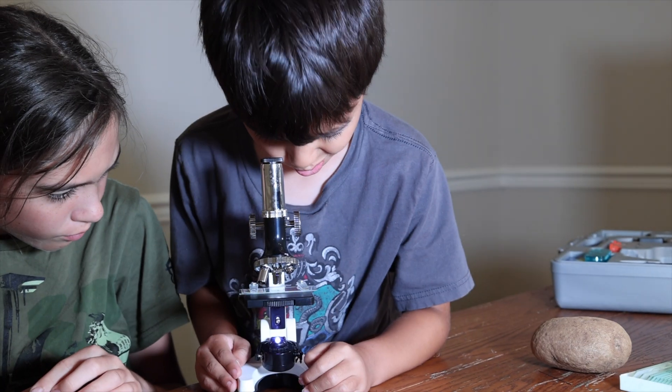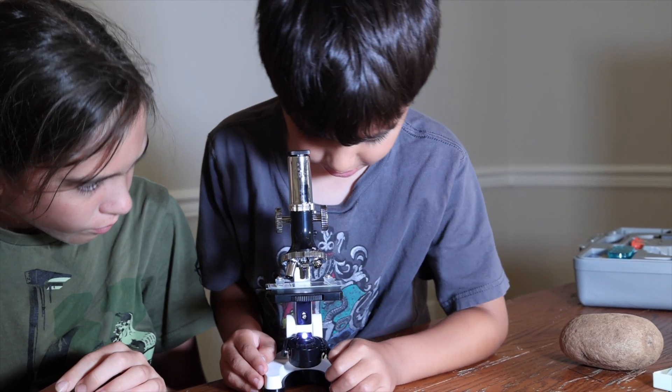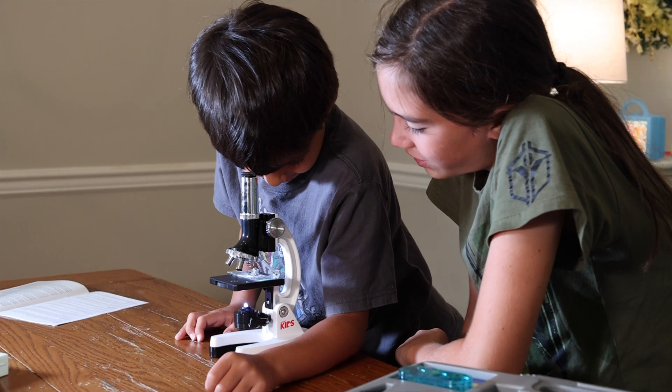Welcome back everyone. In this week's video we're talking all about microscopes and we will be comparing two completely different types of microscopes, so you can hopefully find out which one is best for your homeschooling environment.